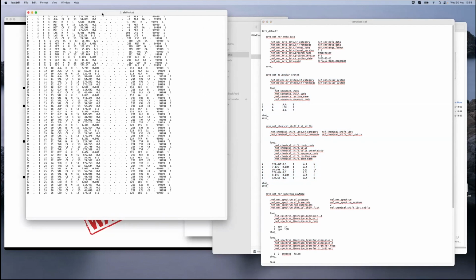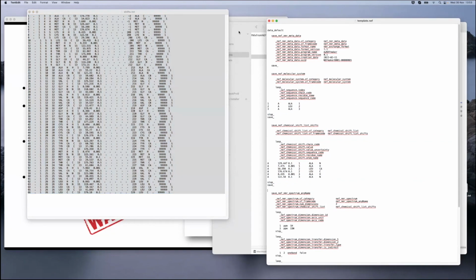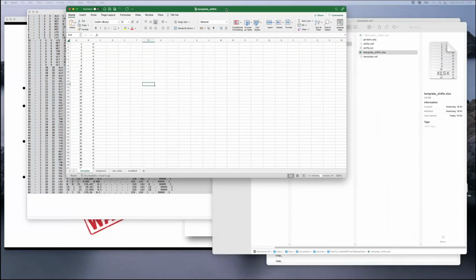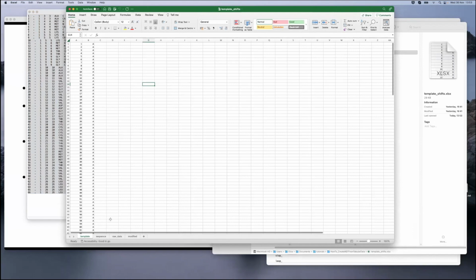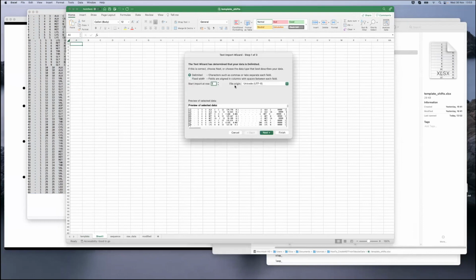So from a fancy command line NEF pipelines, we're going to go to something very basic, which is just Excel. So we can just copy that data from this file, and again we've included the Excel spreadsheet that I use on occasions where I have this problem, and you can import this text file straight into Excel via the text import wizard that opens this kind of pop-up.